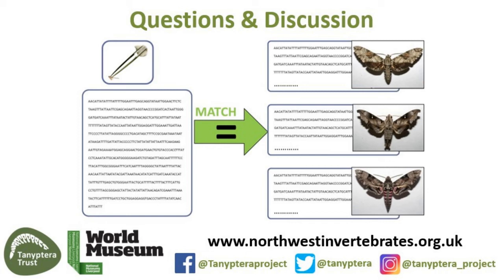Katie Woodcock is asking, have you stored malaise catches for periods of time to extract at a later date? And if so, what did you find to be the best in terms of preservatives and temperature? And also, can I ask what preservative you used in your malaise trap catch bottle? What you found to be the best?